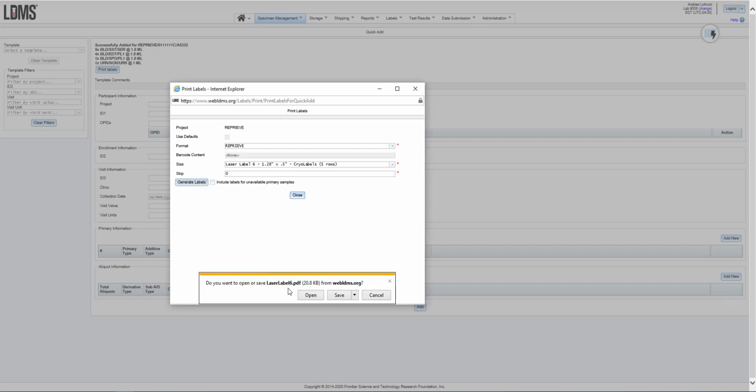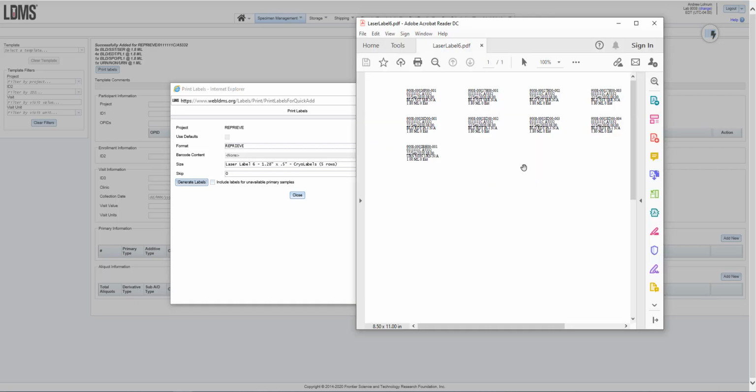I see that a PDF is available. I'm going to click Save and then Open. Here is the PDF file of my labels.